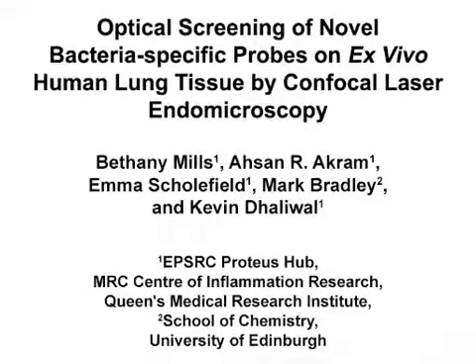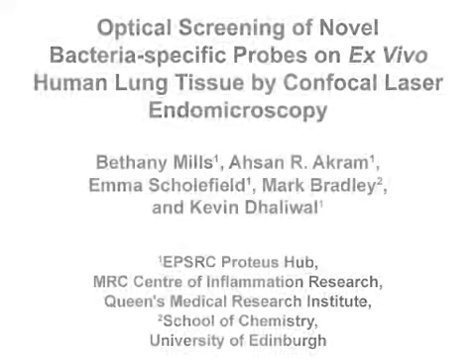The overall goal of this optical imaging technique is to provide a means for rapid screening of novel bacteria-specific optical probes which may have clinical tractability for imaging infection within human lung. This method can help answer key questions in the molecular imaging field, such as whether novel optical compounds are specific to their target and whether they are detectable.